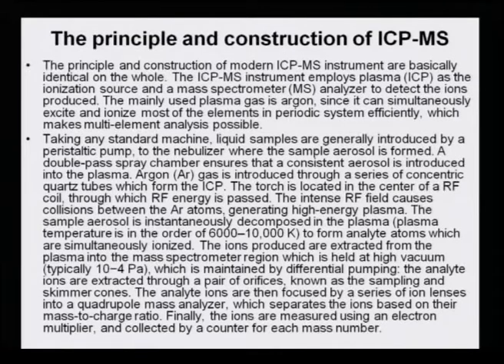The sample aerosol is instantaneously decomposed in the plasma, because the plasma temperature is of the order of 6000 to 10,000 Kelvin, to form analyte atoms, which are simultaneously ionized. So, you see that all this takes place very efficiently because of such a high temperature that the plasma maintains, between 6000 to 10,000 Kelvin.